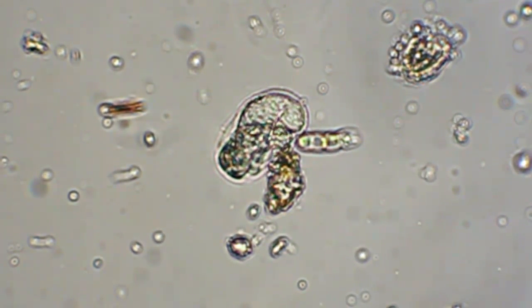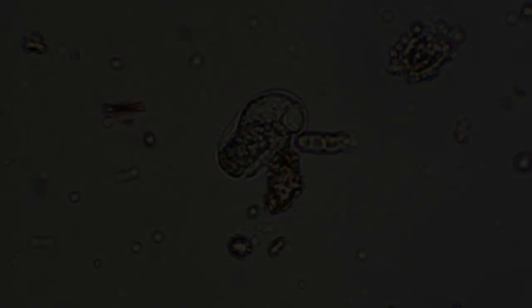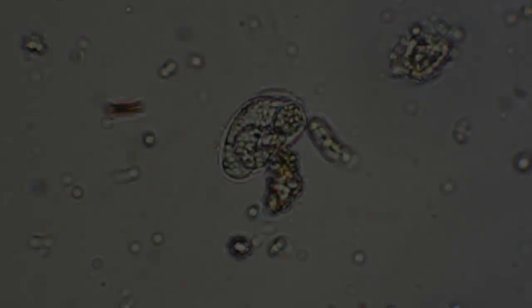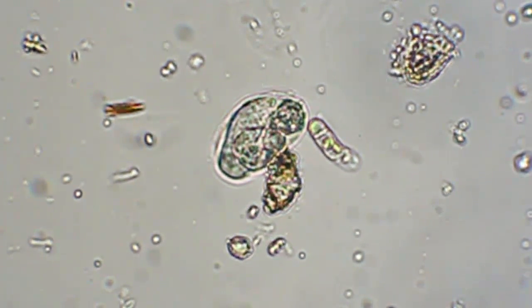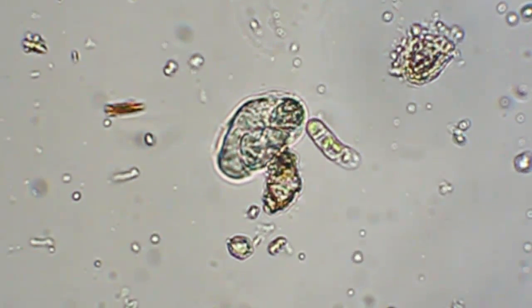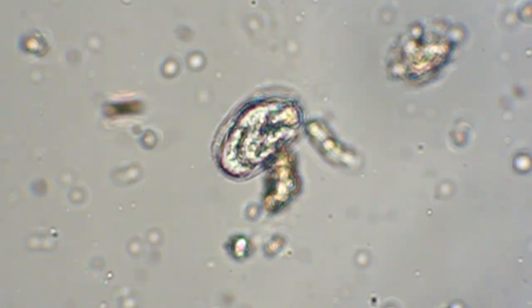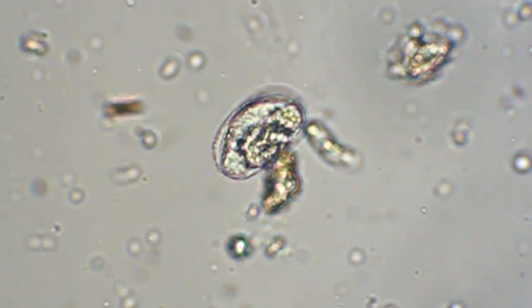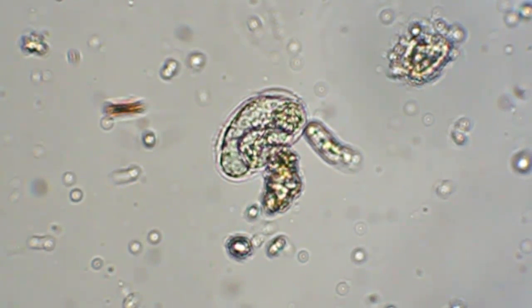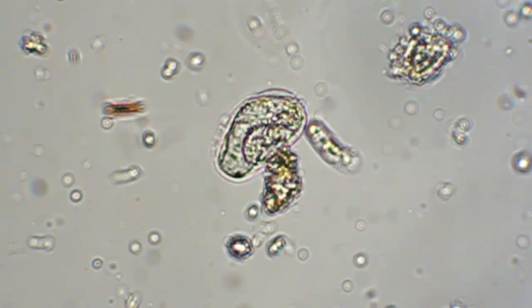I'll take another little break here — time-lapse break. Well, I still don't see any overall change. It's still moving.